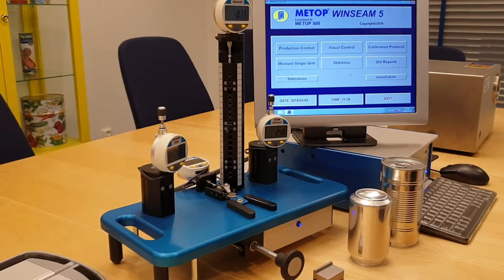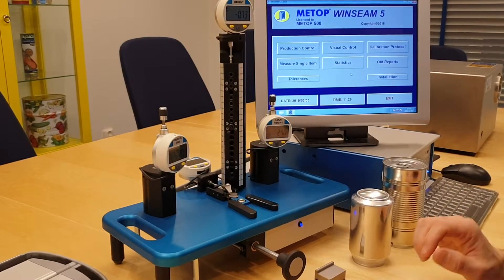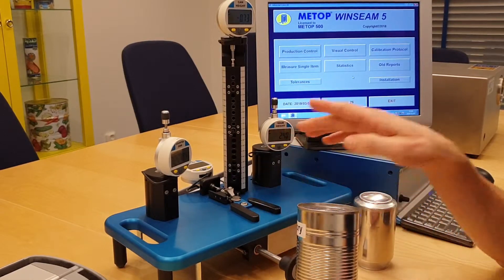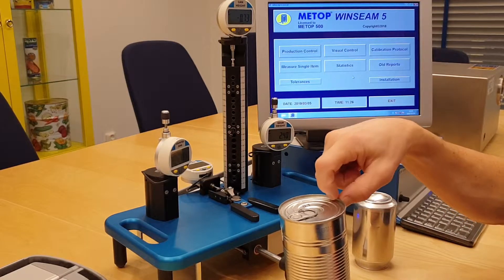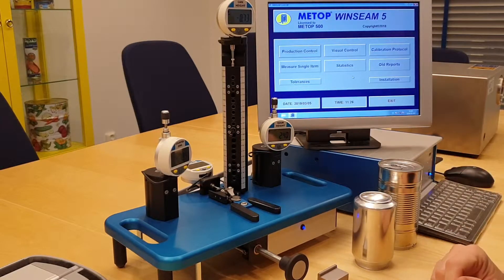I will now demonstrate the Meetup 500 system and the unit we call the mini desk. What we have done here is quite unique. We have combined all four outer parameters into one gauge and one position. We measure the can height, the countersink, the seam height, and the seam thickness in one gauge, one unit, and one position.